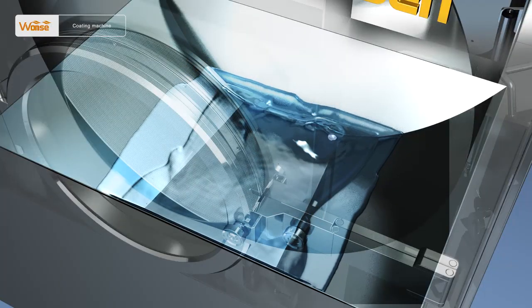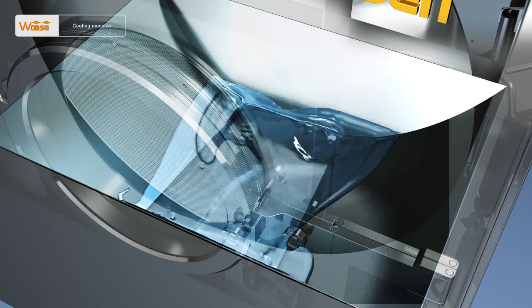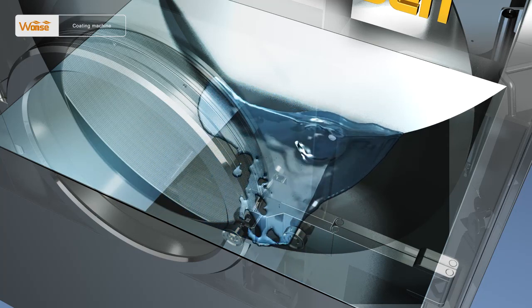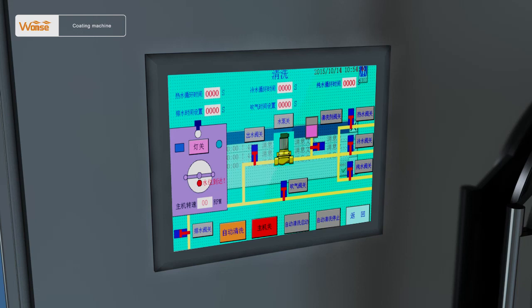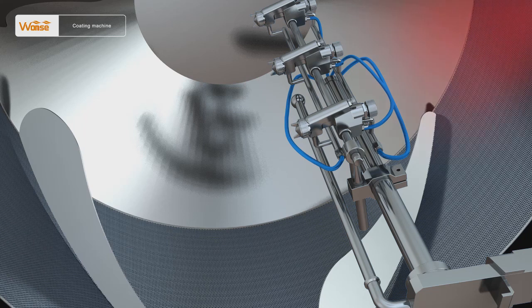When the water in the cleaning tank falls to the lowest water level, close the drain valve. Sixth, close all cleaning valves. Start the hot air cabinet to carry out drying after cleaning. After drying, carry out the next operation.